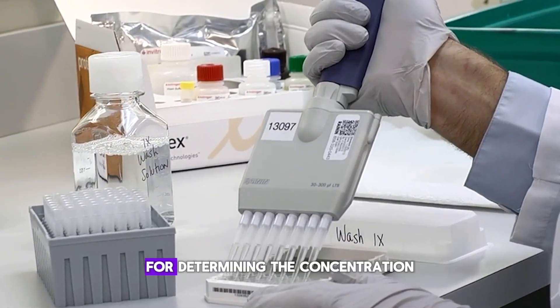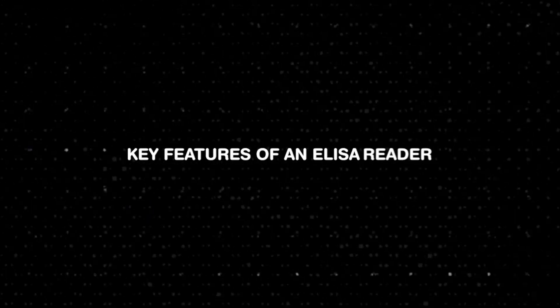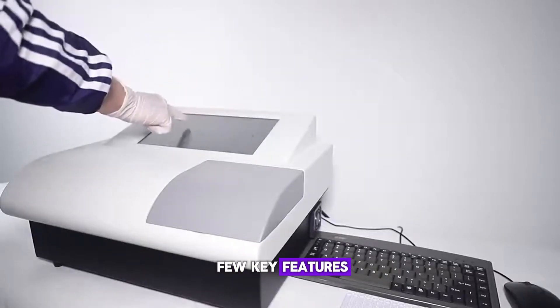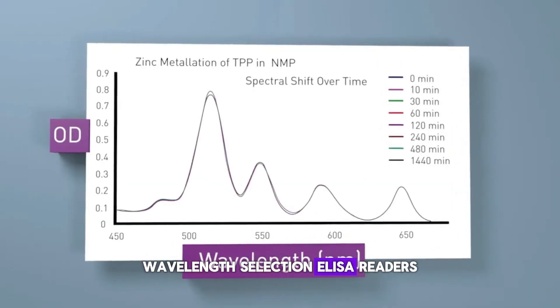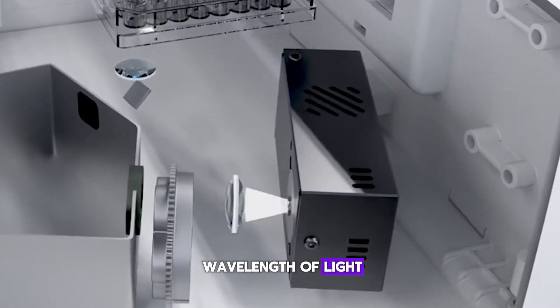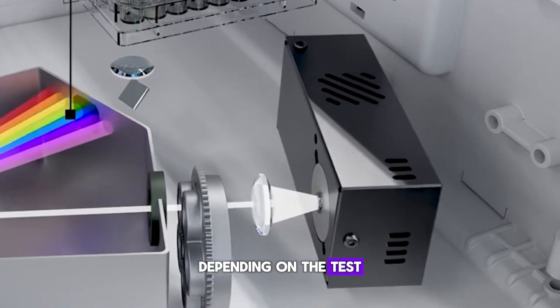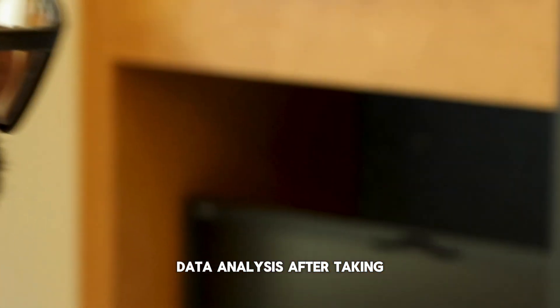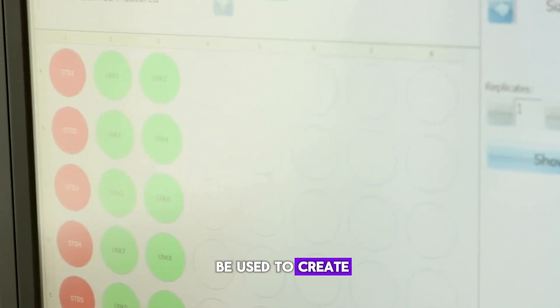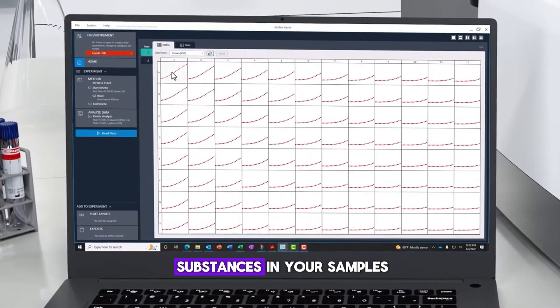Key features of an ELISA reader. First, wavelength selection: ELISA readers use filters or monochromators to select the correct wavelength of light, usually between 400 to 700 nanometers, depending on the test. Second, data analysis: after taking absorbance readings, the machine provides results that can be used to create a standard curve, which helps you calculate the exact concentration of substances in your samples.